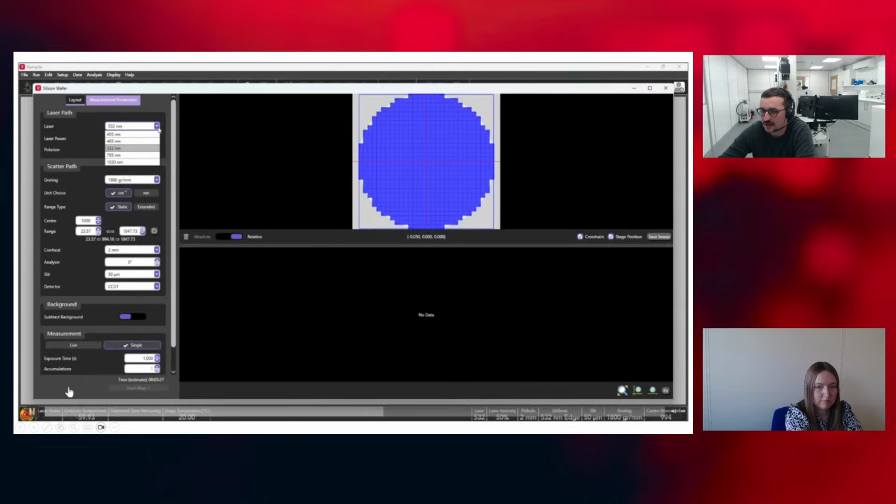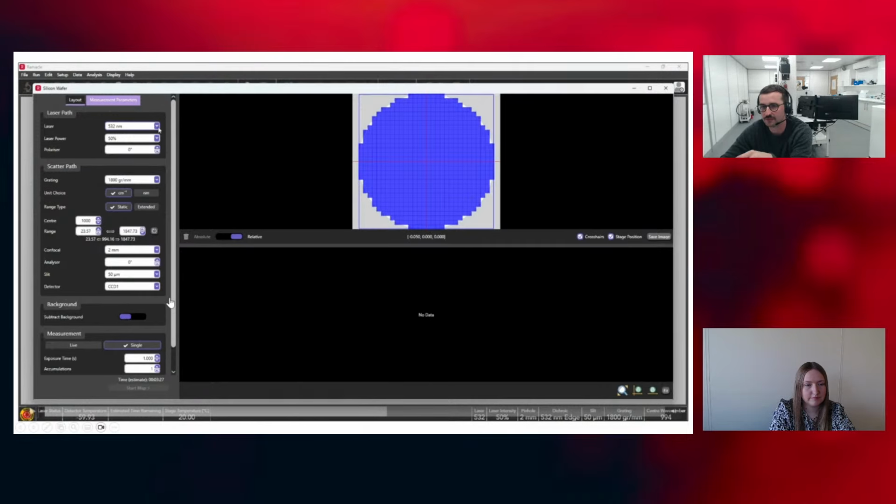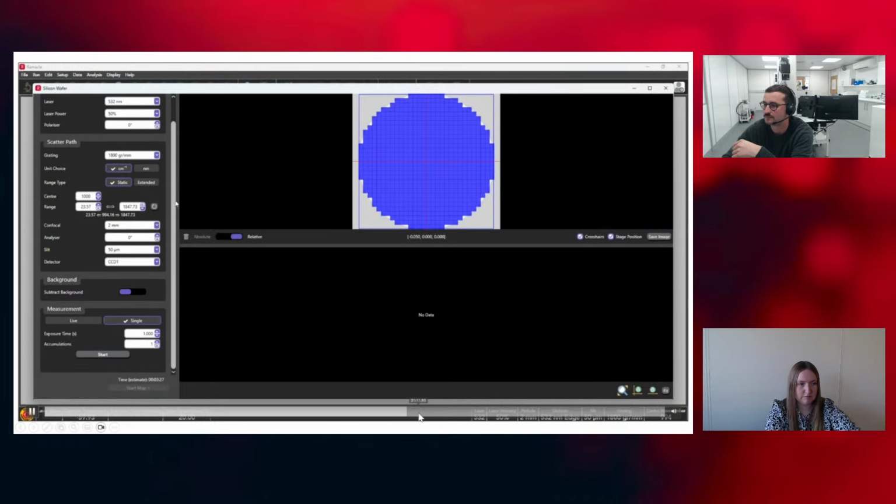So in this section, this is more in line with our regular Raman window. We can select the laser power, the grating, which controls resolution, as we said before, spectral resolution, our pinhole, and detectors if you have multiple. You can just select them in the software. They're automatically selected. Then you set the exposure time for your spectrum, whether it's Raman or PL, and then you can start your map. And I've moved a lot faster in the video.